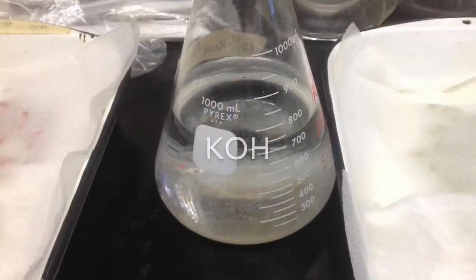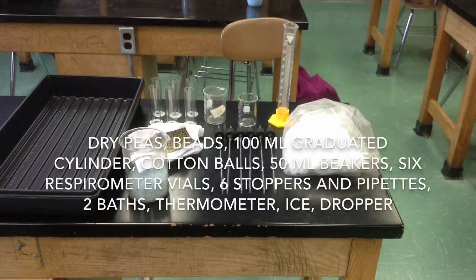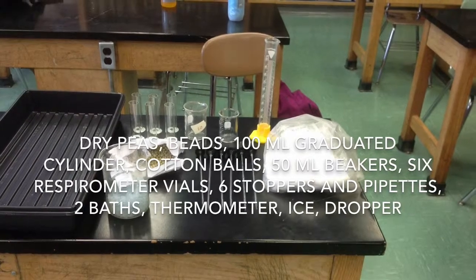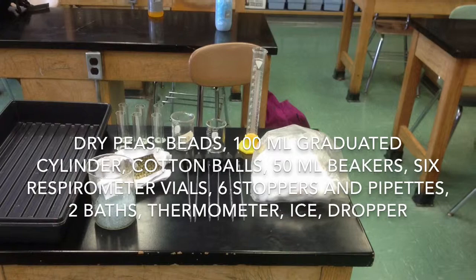Materials: germinating peas, KOH, dry peas, beads, 100 milliliter graduated cylinder, cotton balls, 50 milliliter beakers, 6 respirometer vials, 6 stoppers and pipettes, 2 baths, a thermometer, ice, and a dropper.